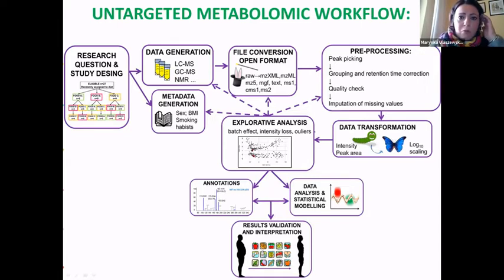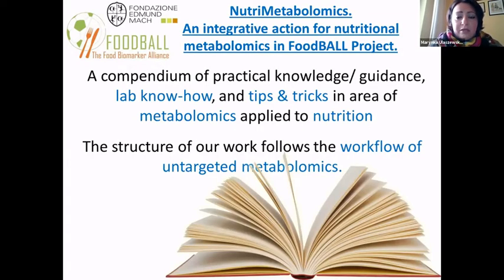If you would like to know a little more about how to design and execute Nutri-metabolomics experiments, I warmly invite you to see this paper about the integrative action for nutritional metabolomics in the FoodBAll projects. That was a fantastic joint partnership initiative, and in the past, as a member of the Foundation Edmund Mach, I had the pleasure to join this project and write this paper, which is a compendium of very practical knowledge and lab know-how, with many tips and tricks on how to do and what to do in the lab, and also what to do with your data.